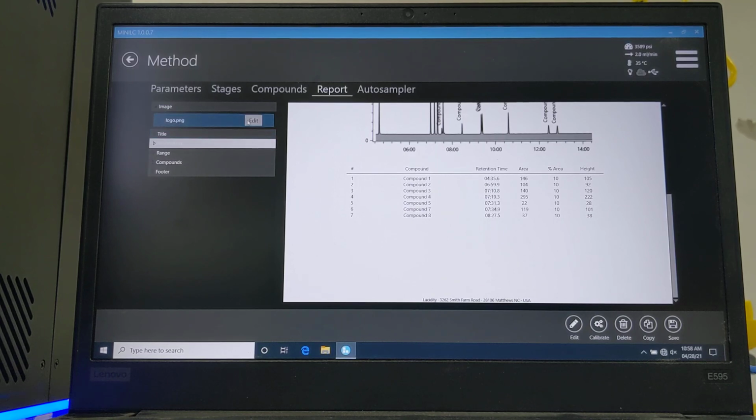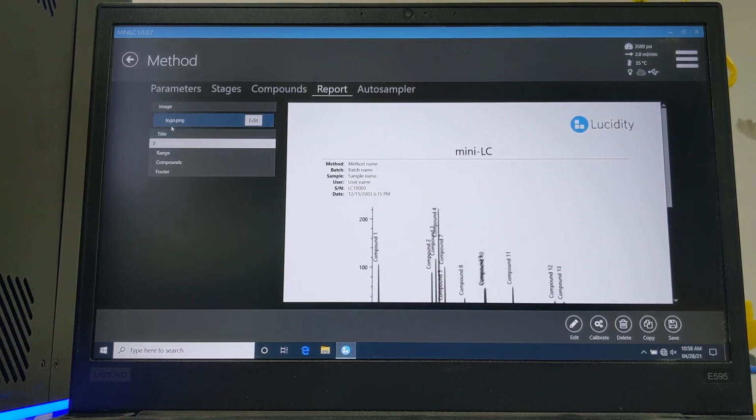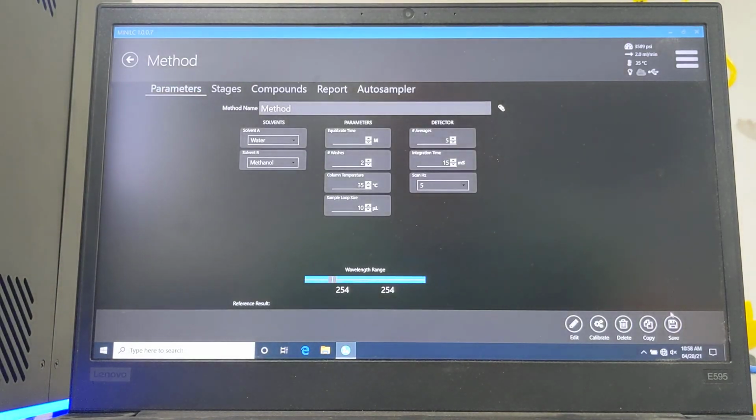The logo, it's looking for picture files. So just make sure that it's in a .png. I think JPEG also works. Make sure that it's those if you have those in place. And then we would click save, and we would have our new method.